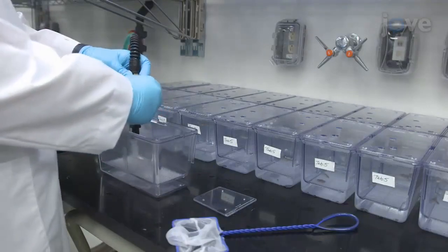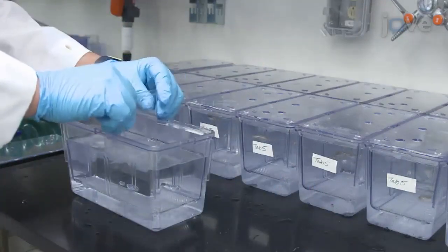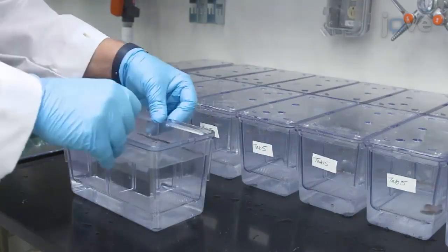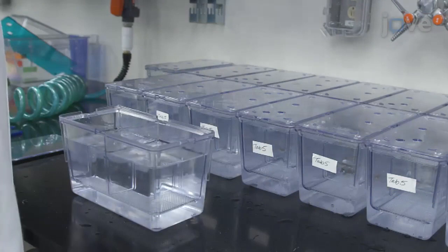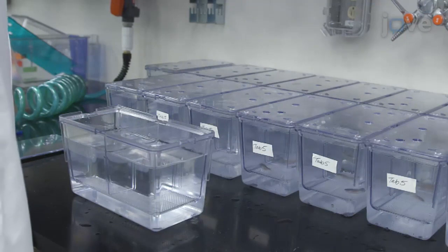For the first breeding strategy, place a few male and female zebrafish in individual breeding tanks and use a divider to separate the males from the females. If this approach is used, set up many different breeding tanks and pool the embryos from each to ensure the biological variability is representative of the population.